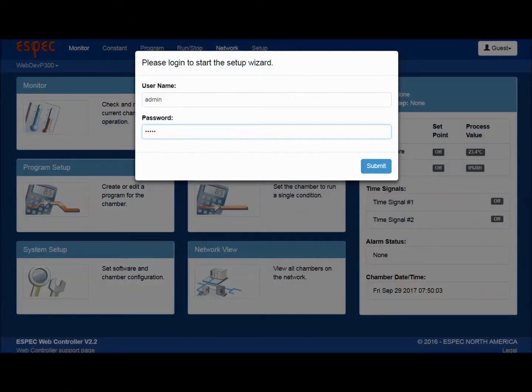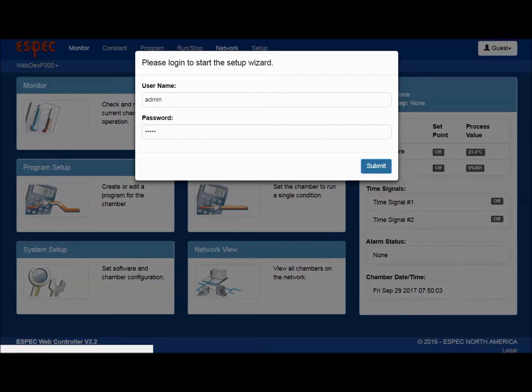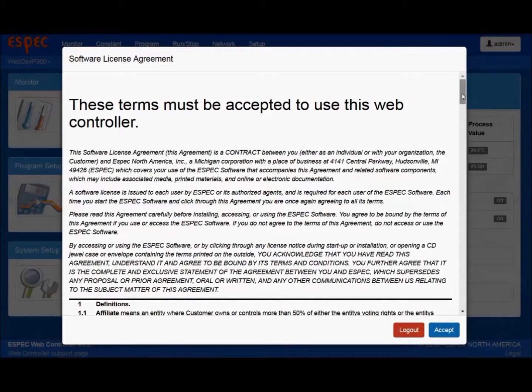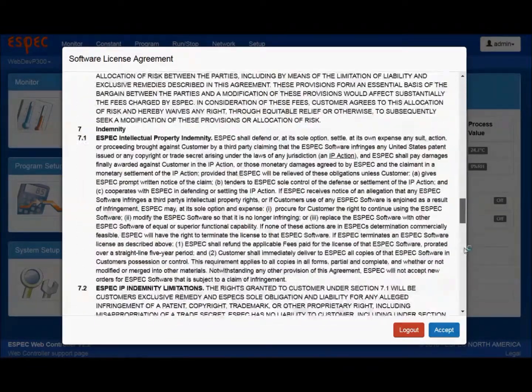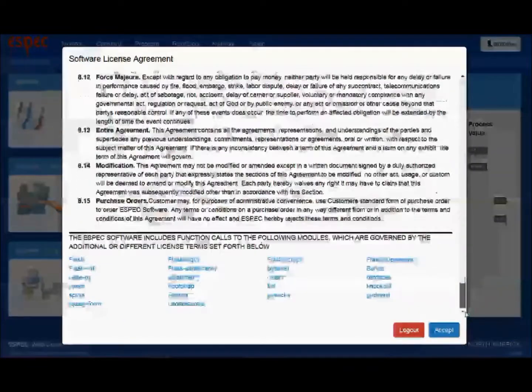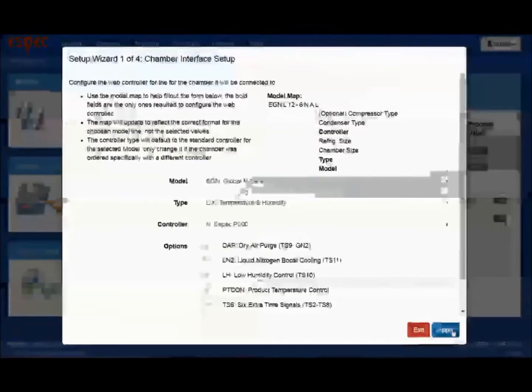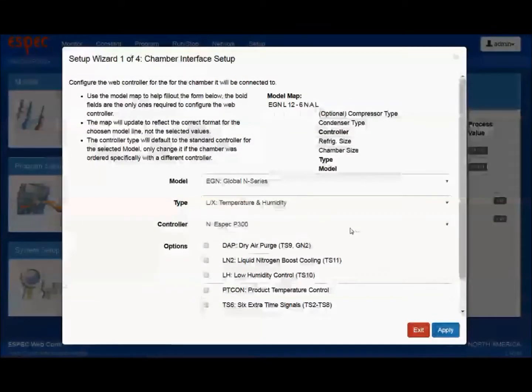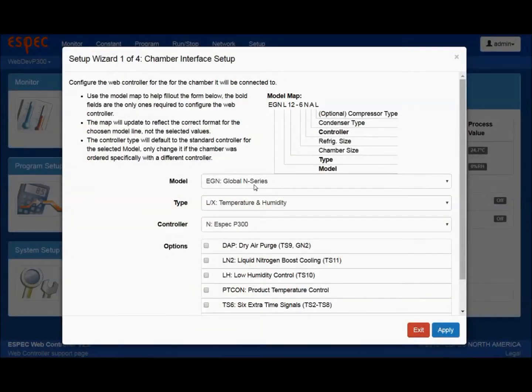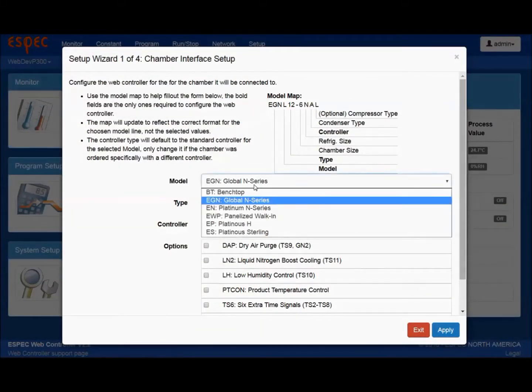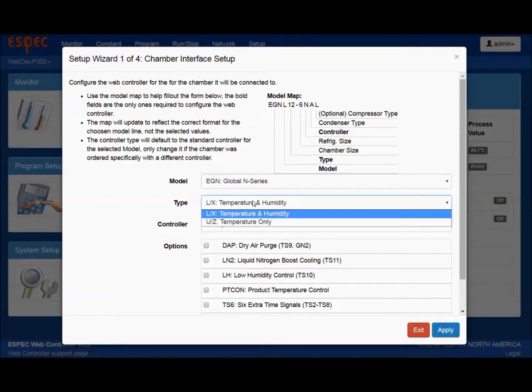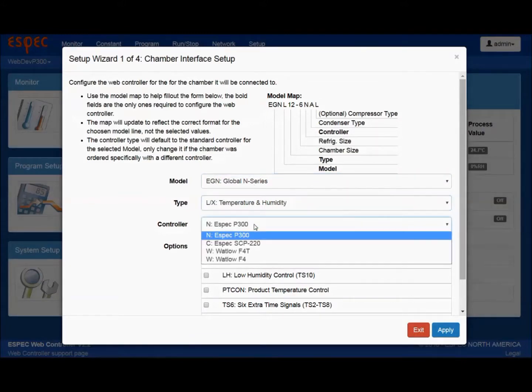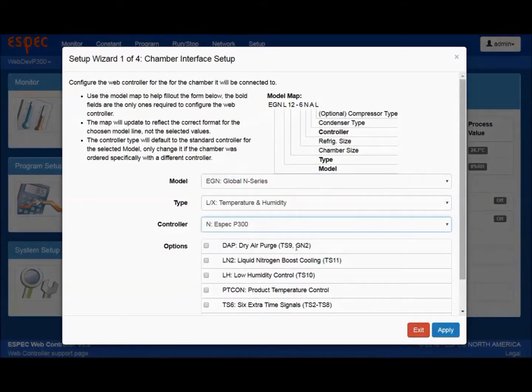Later on in the wizard, you will be prompted to change this default password, which is recommended. After entering the username and password, hit submit and it will continue through the wizard. As you move through the setup, click the buttons in the lower right of the pop-up windows to submit your information. The first section of the setup wizard requires that you know your chamber model, controller types, and all of your included options.